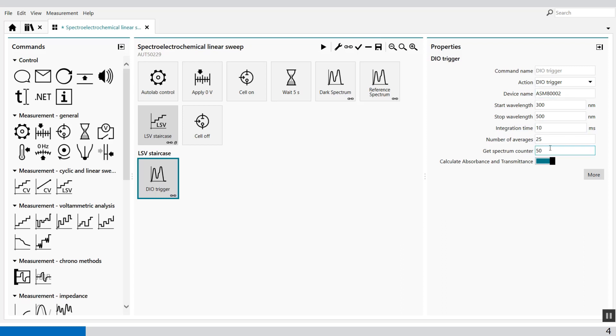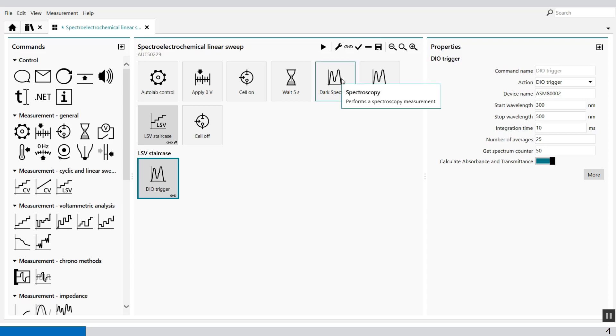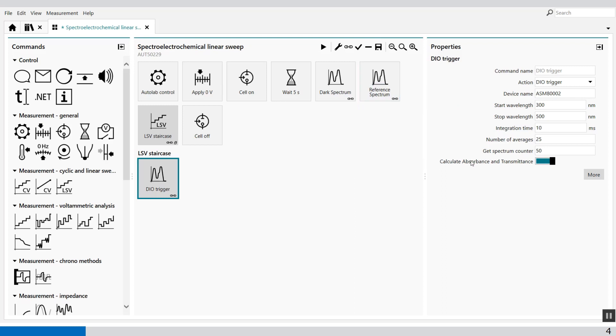So here it said get the spectrum after 50. You can also calculate automatically the absorbance and the transmittance and then this button is switched on. But it needs a dark spectrum and a reference spectrum to calculate the absorbance and the transmittance.